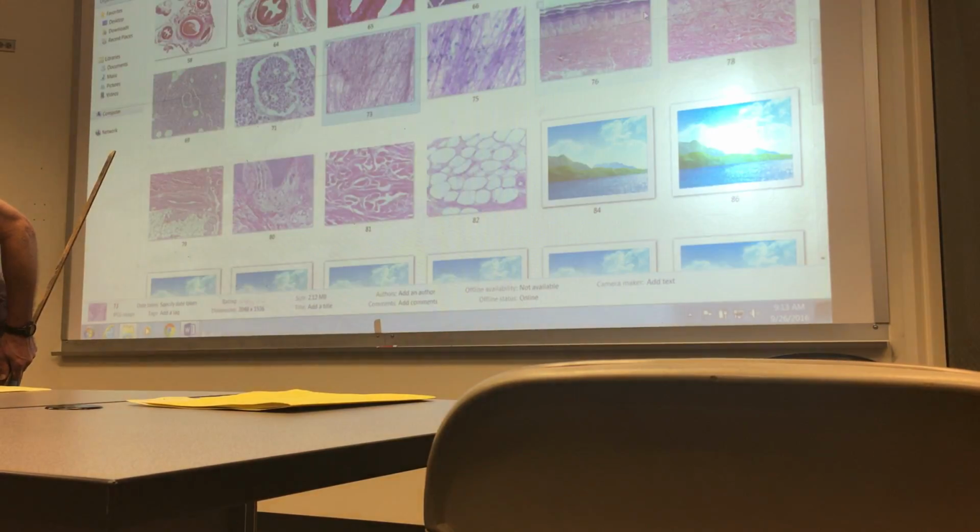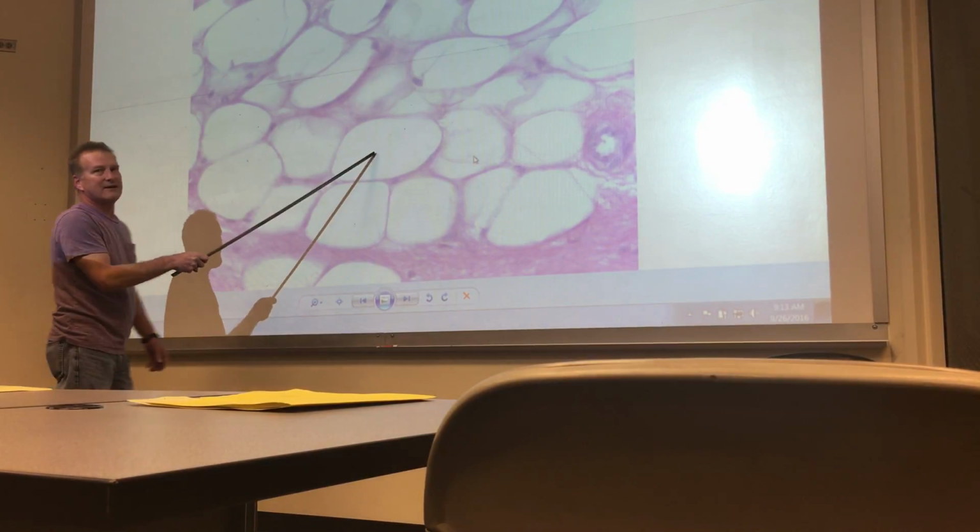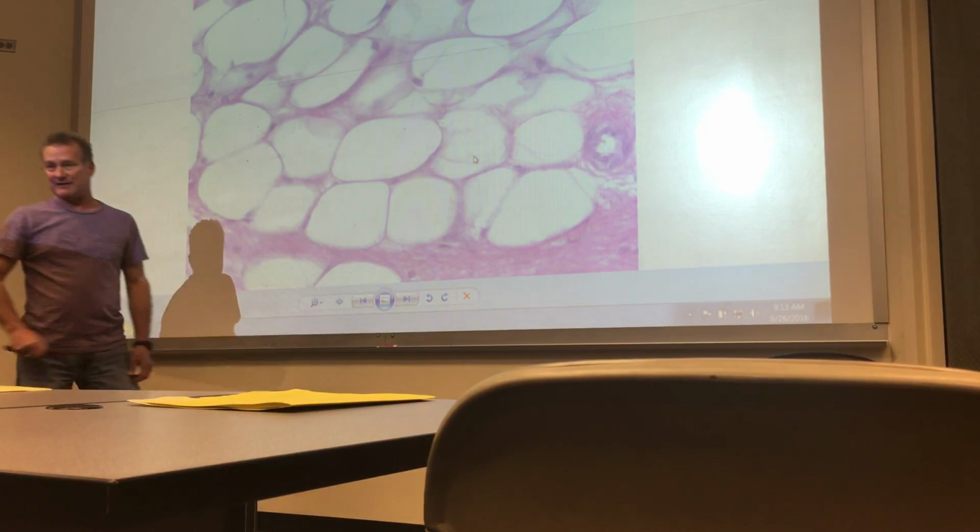With something like this, I can say, name this cell, and you're going to say adipocyte.